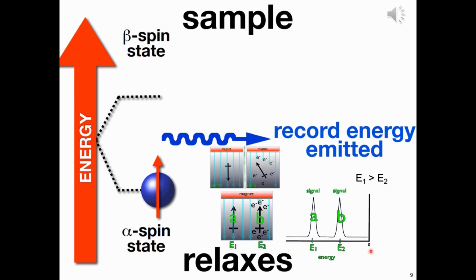Now, there are two ways of running the NMR experiment. They include varying or sweeping the magnetic field over a small range while observing the radio frequency signal from the sample, or equally, there's an effective technique whereby the frequency of the radio wave radiation is increased while holding the external magnetic field constant. Regardless of the choice of NMR experiment, we're usually interested in the outcome, which is the NMR spectrum itself, and it looks a bit different to the mock-up we have on this diagram.